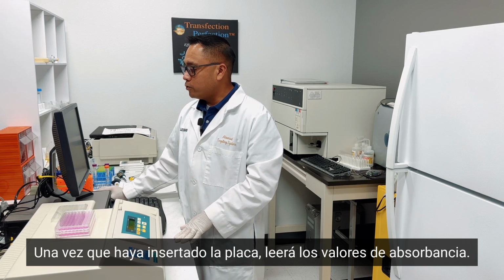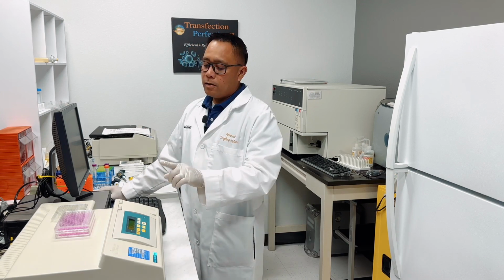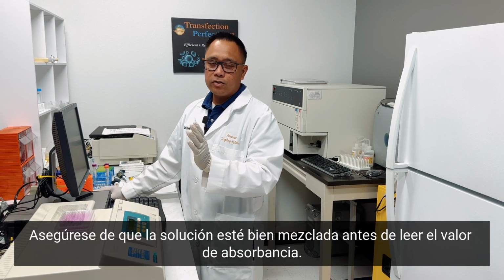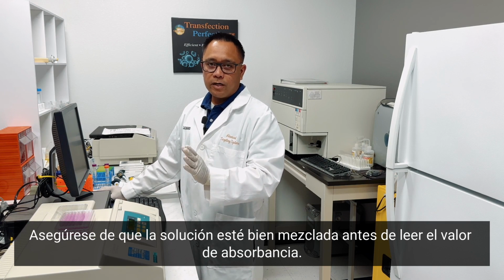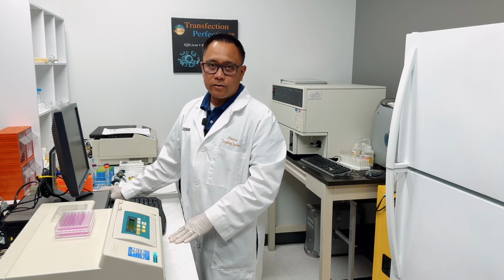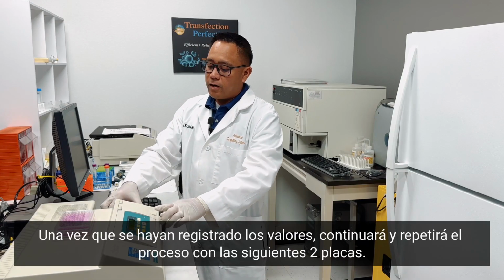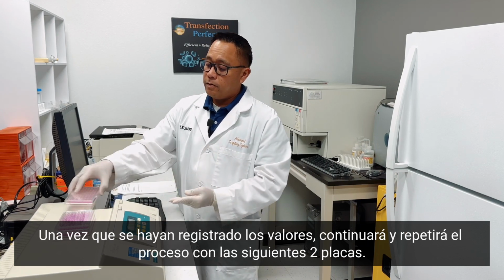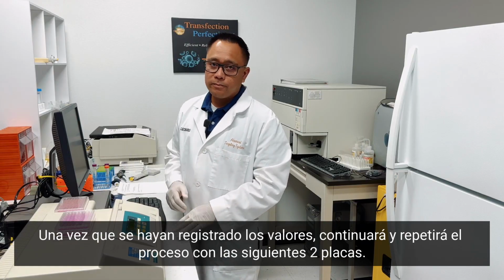you'll want to read the absorbance values. Quick to note, you'll want to make sure you shake the plate before you read them. This makes sure that the solution is thoroughly mixed before reading the absorbance values. Once the values have been recorded, you'll go ahead and repeat for the following 2 plates.